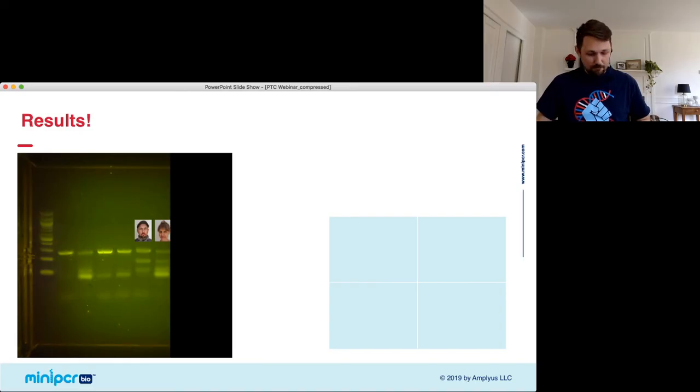I could taste it, and sure enough, off of one of my chromosomes, I made a 250 base pair fragment that got cut into two, so I have the 100 and 150. And on my other chromosome, it was not cut. So I am a heterozygous taster.